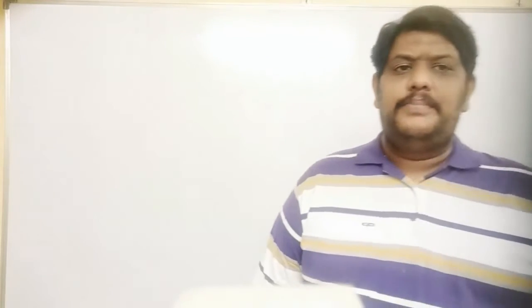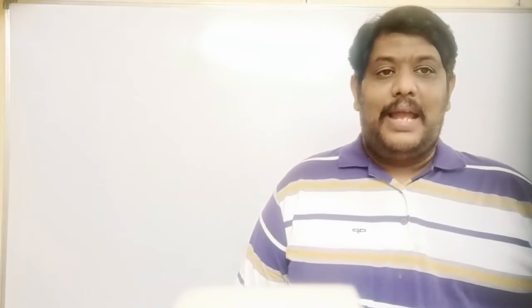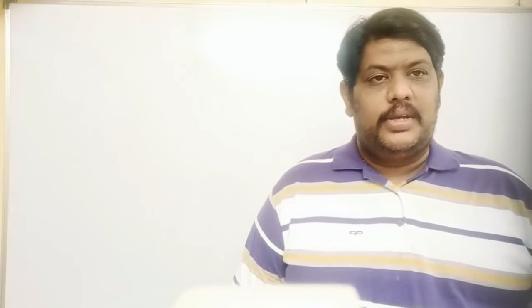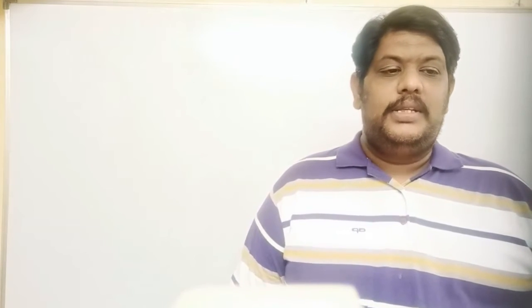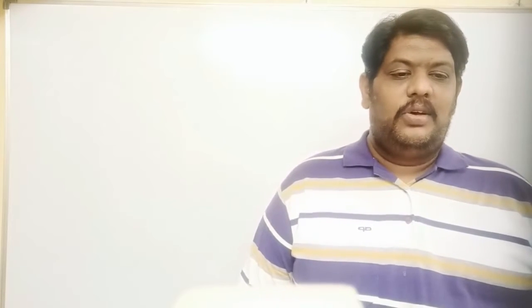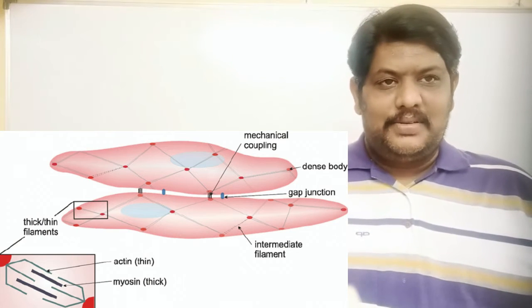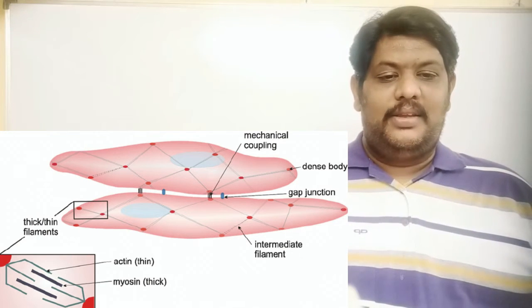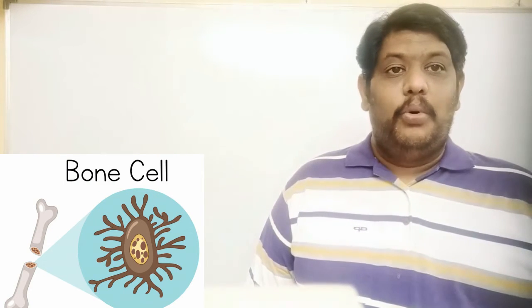Now here we will observe different kinds of cells which are present in the human body. Now we'll have slides in our classrooms and schools, you can observe them, or else you can see them on the screen. So these are the slides which can be observed in the microscope, especially using the slides which are there in our labs. The first one you can see is the muscle cells. So your body will have muscles, right? So how will the cell look? You can see the shape of the muscle cell here, and then bone cells.